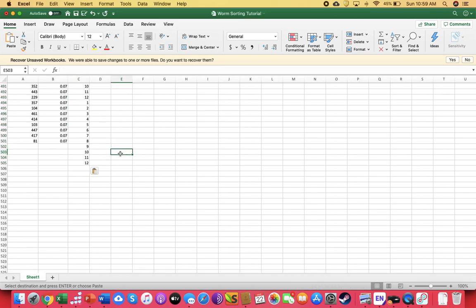Okay, and you can see that doing this I've overshot it. We don't have an equal number of worms in each tank. We don't want that. We want equal numbers of worms. We don't want these extras right here, so we're going to get rid of these guys. And that gives us 8. You can see that this is 8: 1, 2, 3, 4, 5, 6, 7, 8.